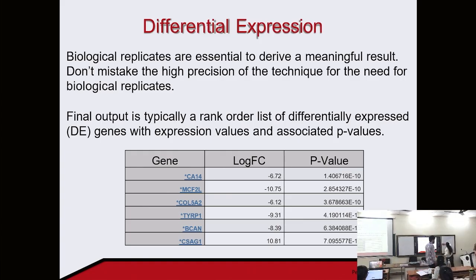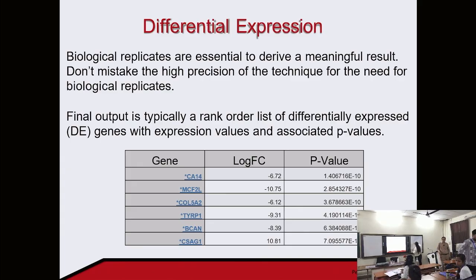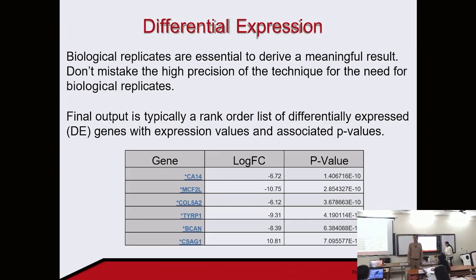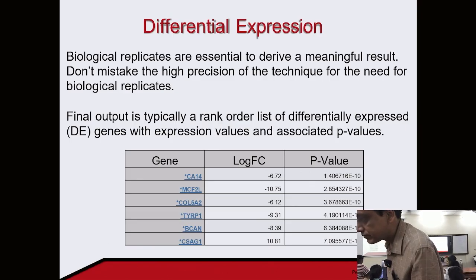So I can at least discuss while others are coming regarding fold change that I already discussed with you. So can any of you explain what is fold change? Fold change in RNA expression. So what does fold change mean? What it means? How many times it is upregulated and how many times.